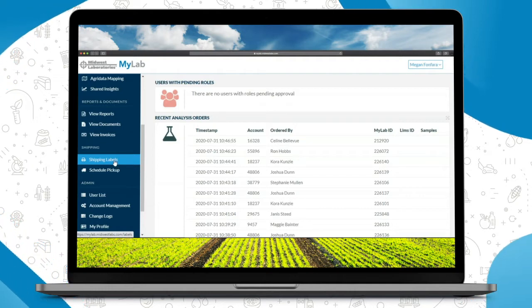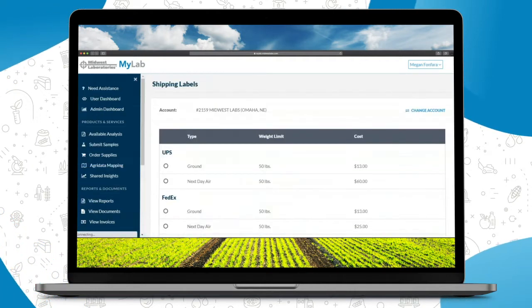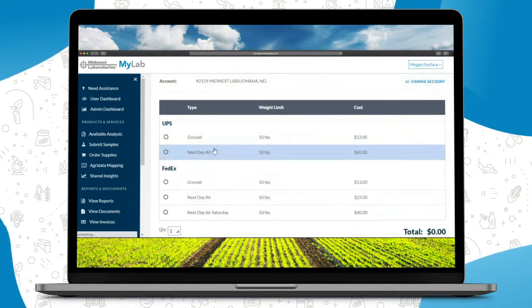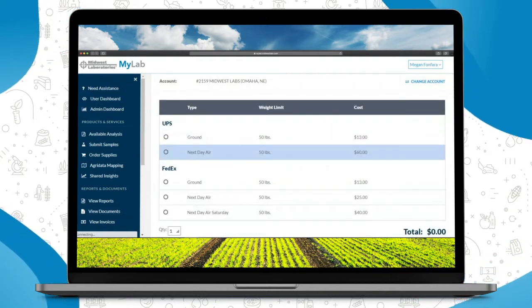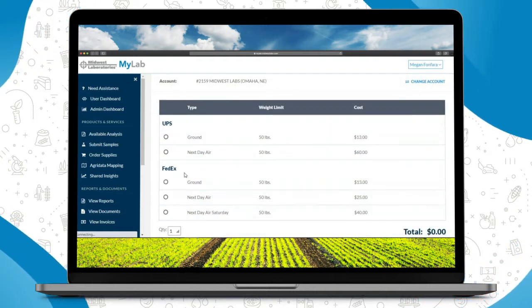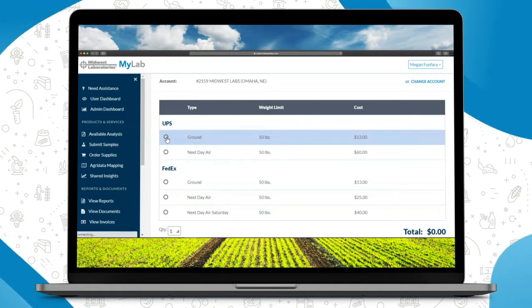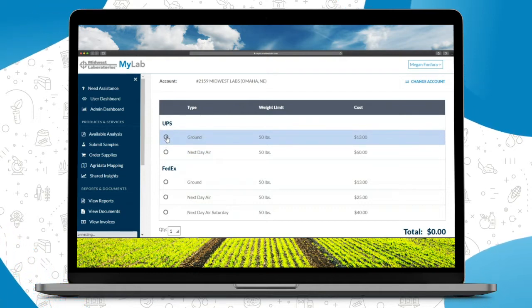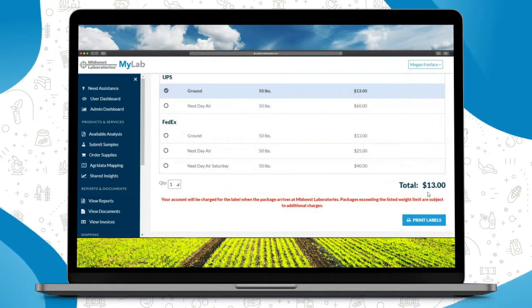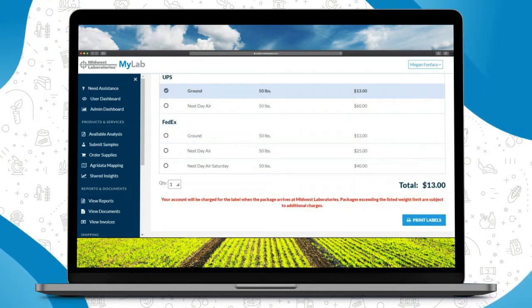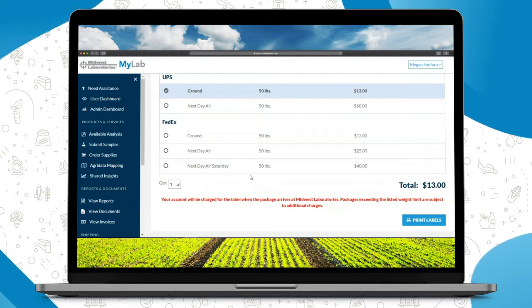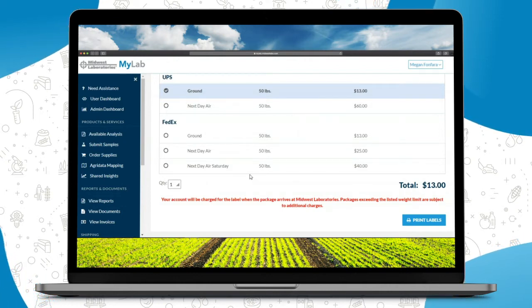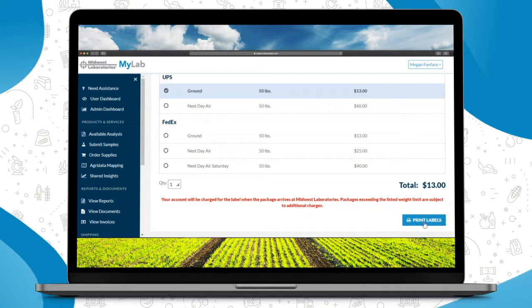When you're ready to send in those samples, you can click on shipping labels. You'll have choices here from UPS and FedEx and pricing. Let's say you're going to send in your shipment through UPS Ground today. You'll select the button next to that and then you'll see the total down here. You will not be charged for any of these labels until they're physically received and scanned in by the lab.